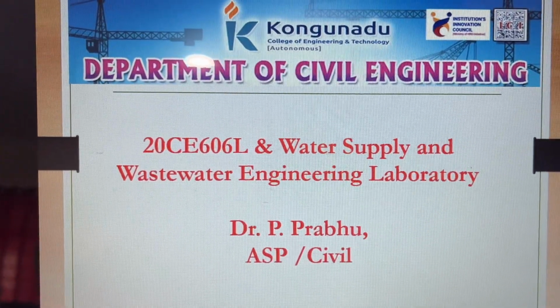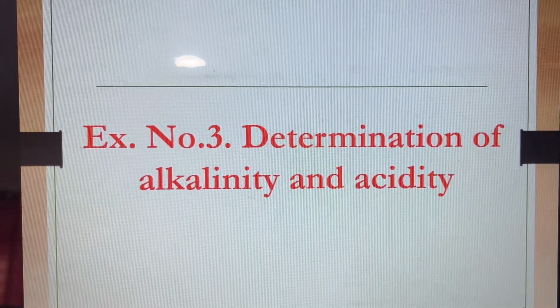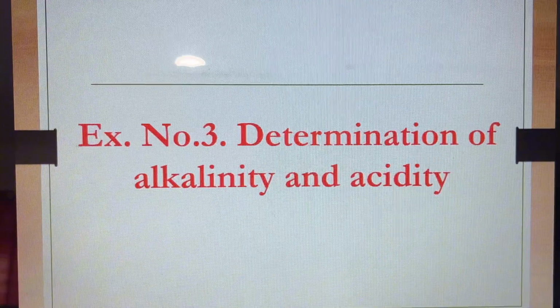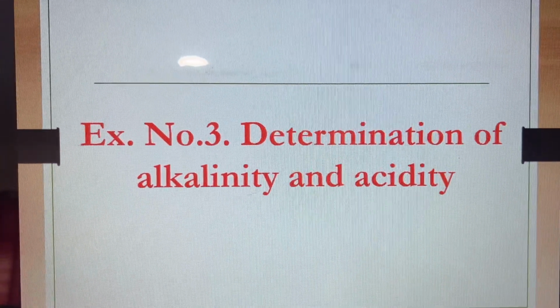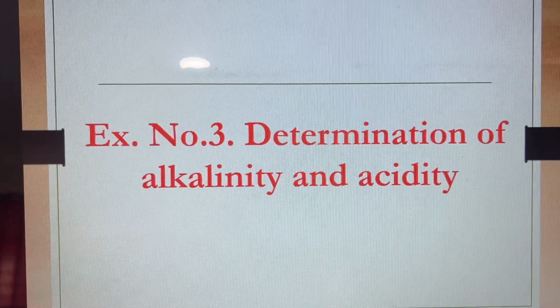So let us have the experiment number 3 now, the determination of alkalinity and acidity. So let's see the laboratory part of doing this experiment.